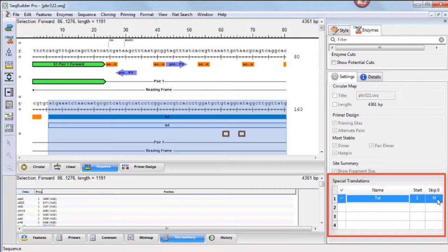You can use this table to change its name, the start position, or whether the zero should be skipped or not.